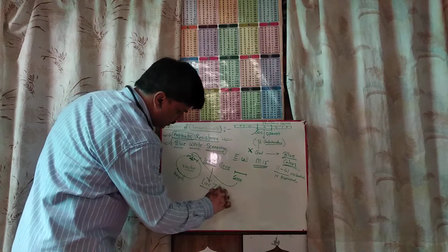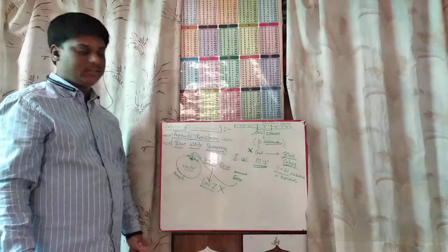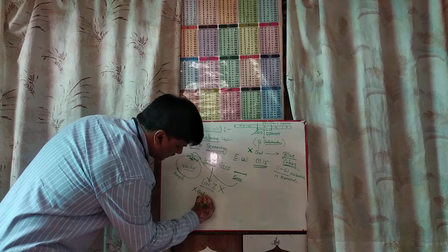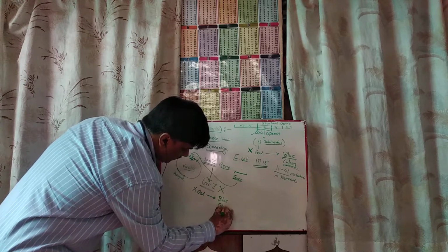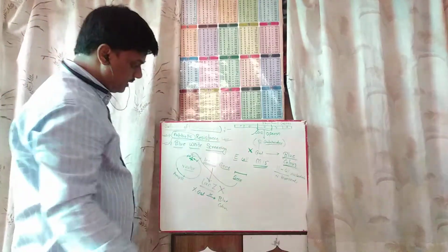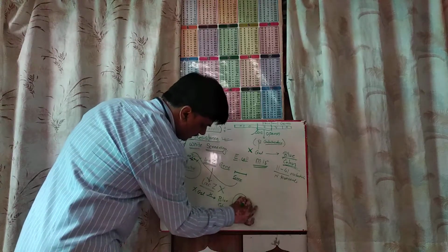So no lac Z gene, because its property gets lost, so it will not convert X-gal into a blue color product. This reaction will not be possible, and the colonies appear.